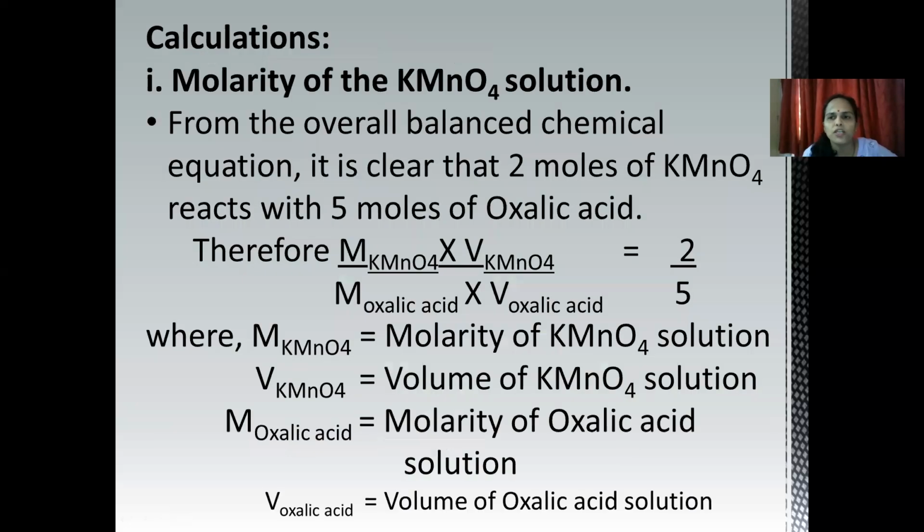I hope observation table is clear. Then we'll go for calculations. We'll calculate two things here. Molarity of KMnO4 solution is the first one, and the second one is strength of the given KMnO4 solution. So you see how I calculate molarity of the given KMnO4 solution.